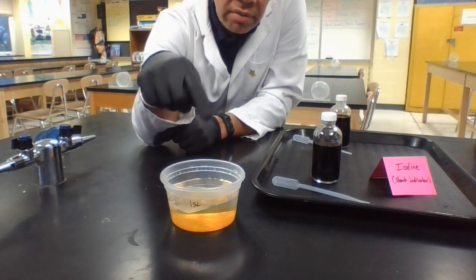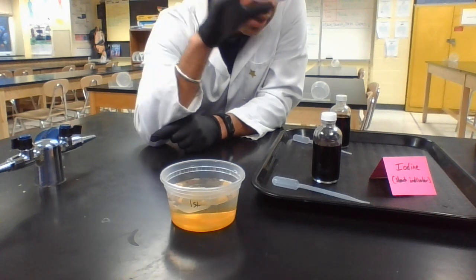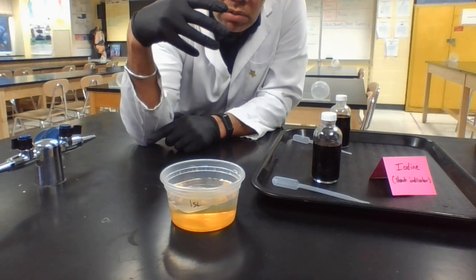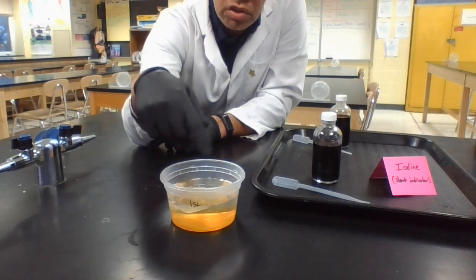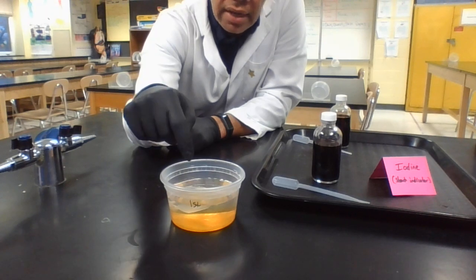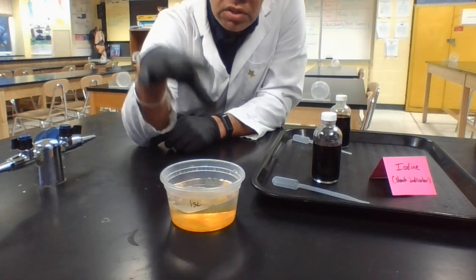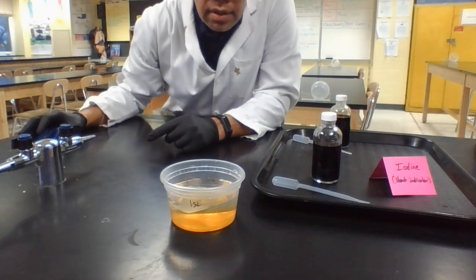And so don't forget, we also have sugar inside of there. And so when iodine touches sugar, nothing happens. But if sugar can get out, we can test this water with something else tomorrow to see if sugar was able to get out. Or if starch gets out, think about what might happen to the water outside that has iodine in it. Or if iodine is able to get in, think about what might happen inside of this bag if it does do that. So, okay, have fun.